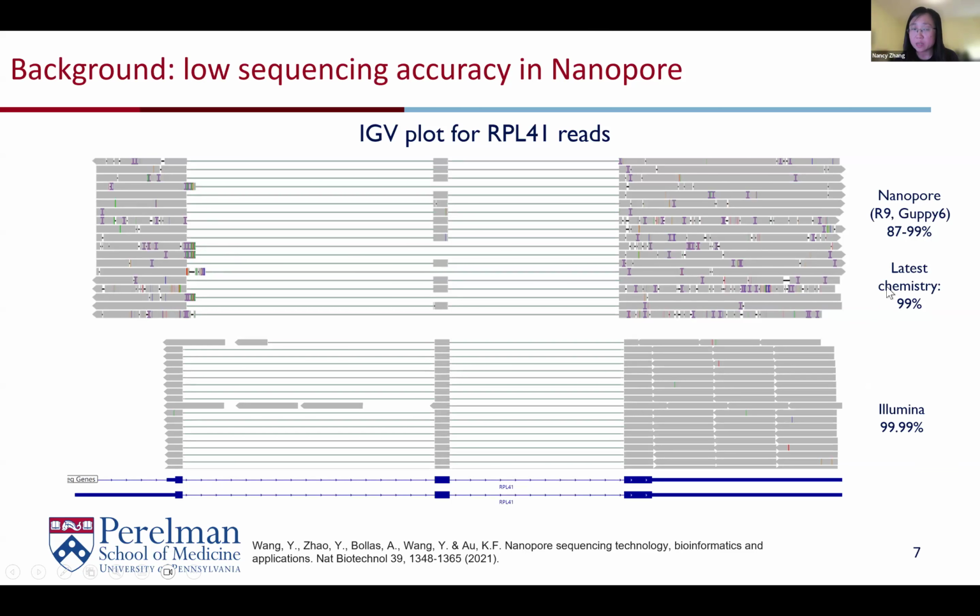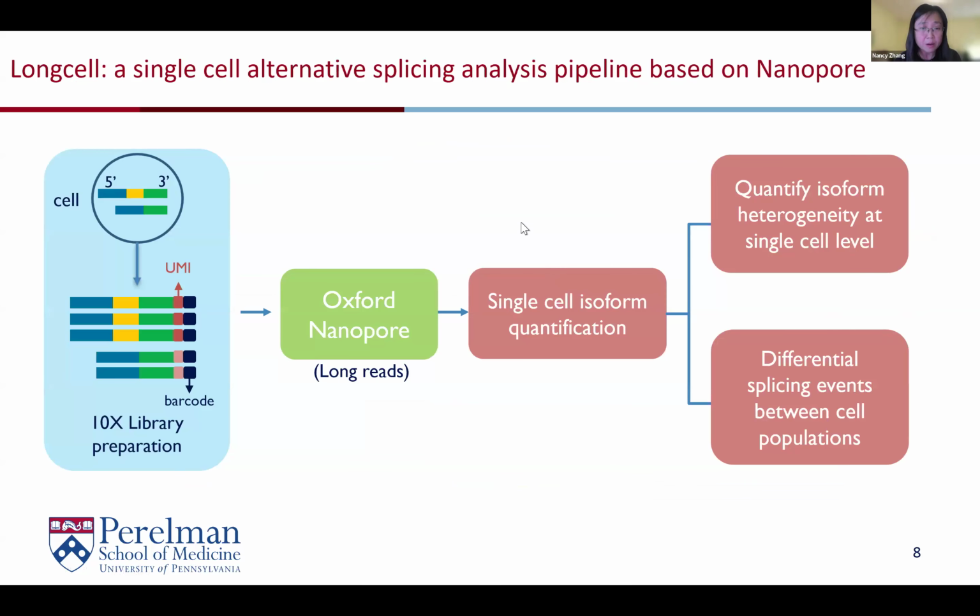However, as our benchmarking will show, the artifacts that we have discovered in the low accuracy phase of nanopore sequencing still carry forward. And I'm talking about this in the abstract. I'm going to go into the details in just a bit. So first, a high-level picture.